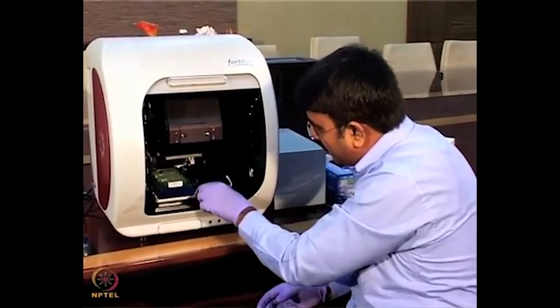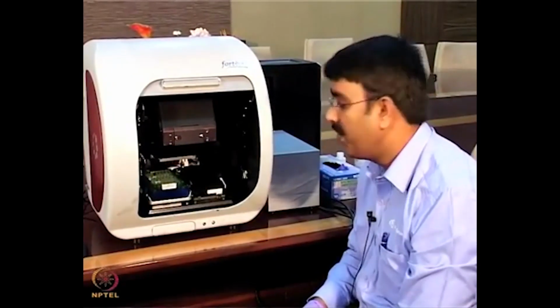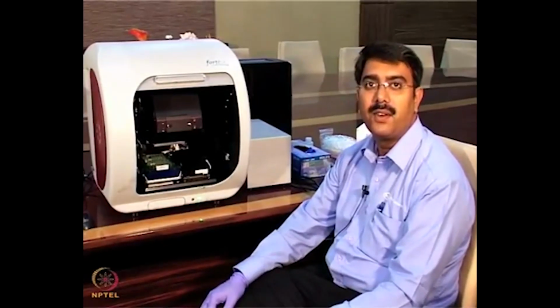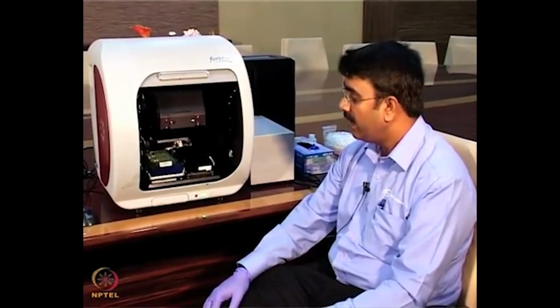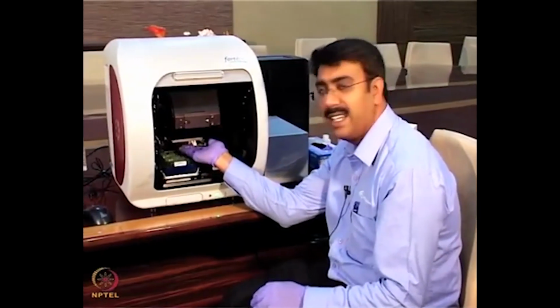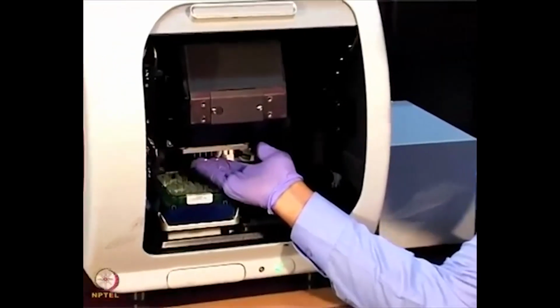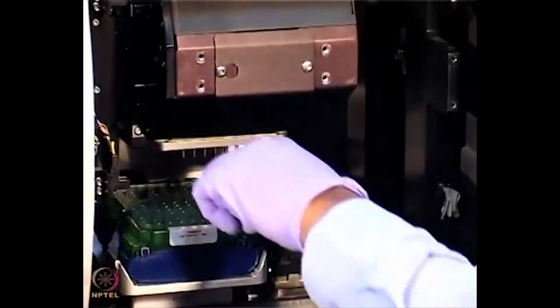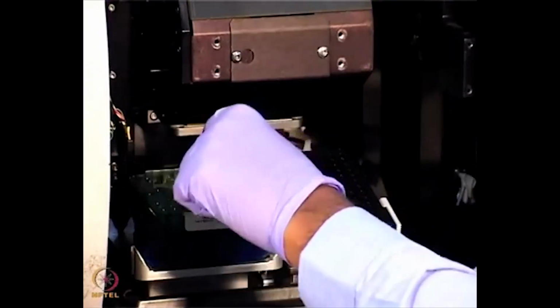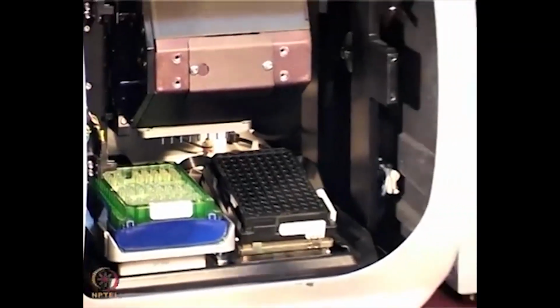This works on the principle of dip and read as well as biolayer interferometry. You know about the principle behind biolayer interferometry from the last talk. Here it consists of a white light, which is a light emitting diode. The light is passed through the sensor. This is the sensor.